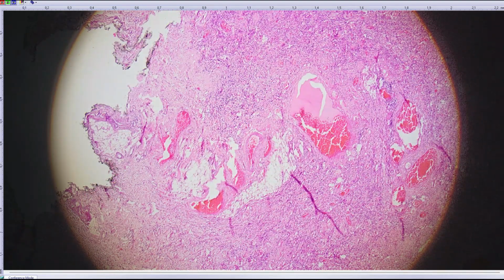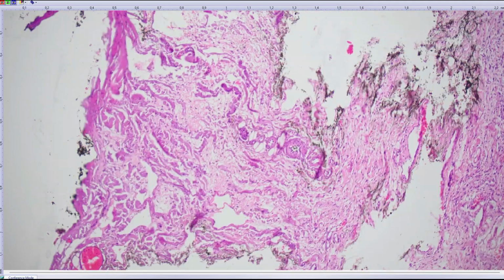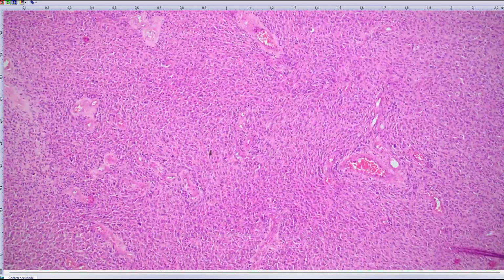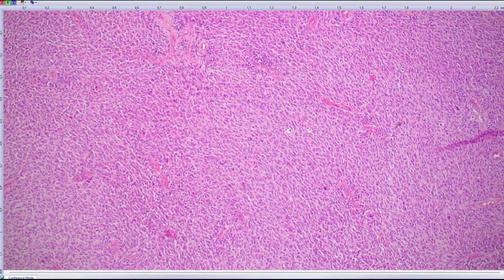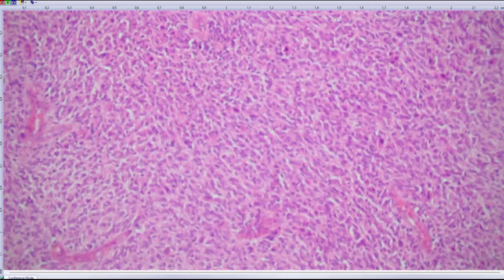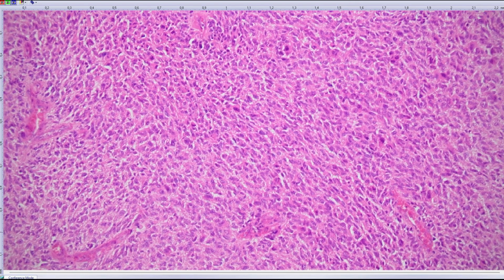on the back. Unfortunately, there is no nice remnant of fat tissue, well differentiated component, but it's not necessary for the diagnosis. It's quite important to get this diagnosis because although it's a high-grade sarcoma, dedifferentiated liposarcomas have a better prognosis than undifferentiated pleomorphic sarcomas or leiomyosarcomas. Without the MDM2 detection, we would call this undifferentiated pleomorphic sarcoma, which is a very high grade, very aggressive tumor.